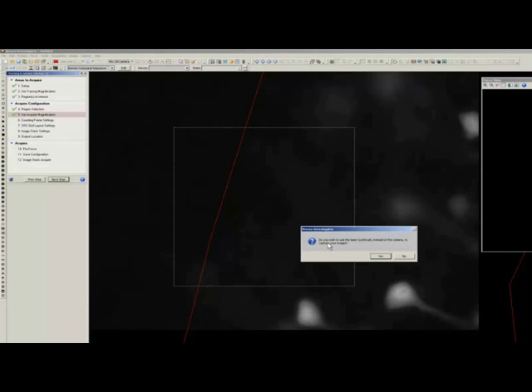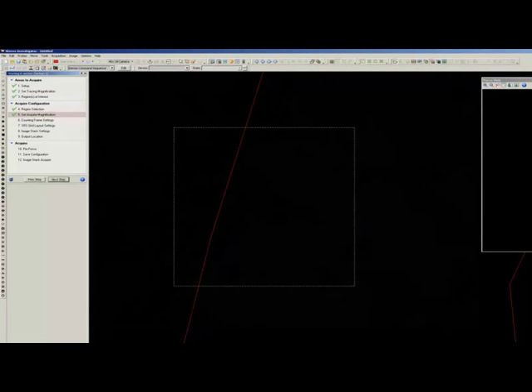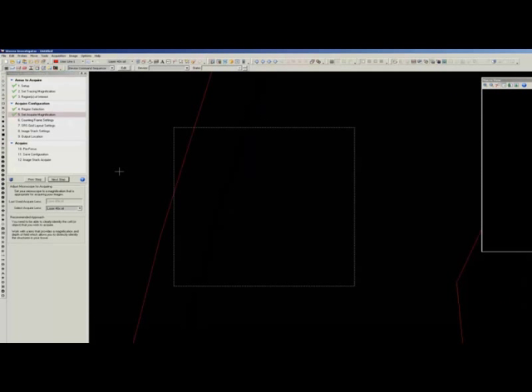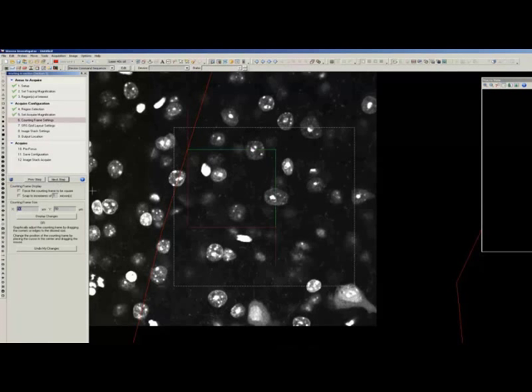Now, we're going to switch from the digital camera to imaging with the laser to capture the images. And you'll be able to see that the scaling has changed to match what we see in the digital camera. Right. You can see that Stereo Investigator has recognized, first of all, that you have a confocal. Second of all, it asks if you want to use it. And then when you say yes, it automatically selects the lens scaling that's appropriate for that device. Right. And this level of integration that we feel makes this a much, much more streamlined process than what you were able to achieve in the past in the context of confocal stereology.